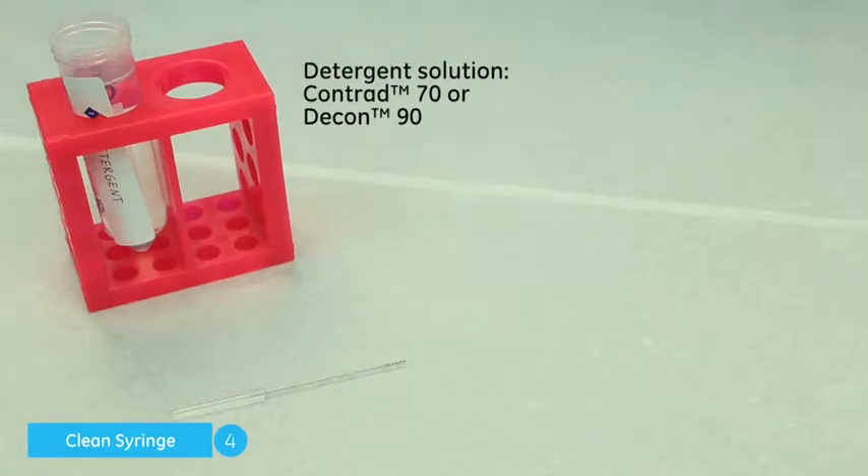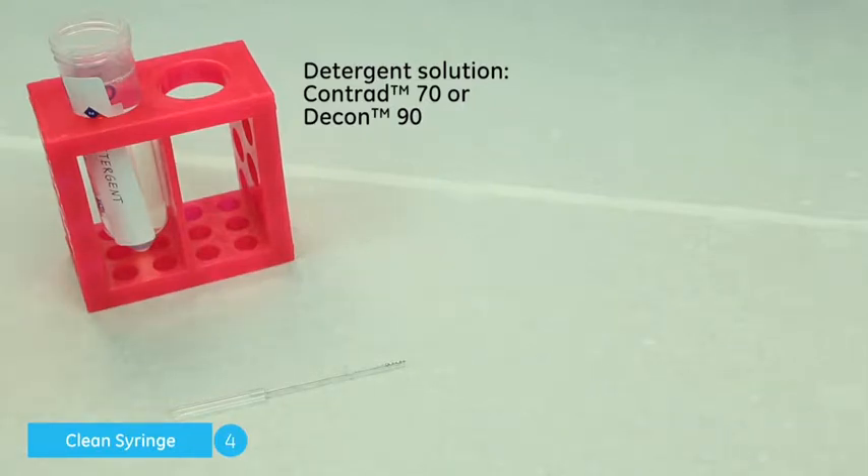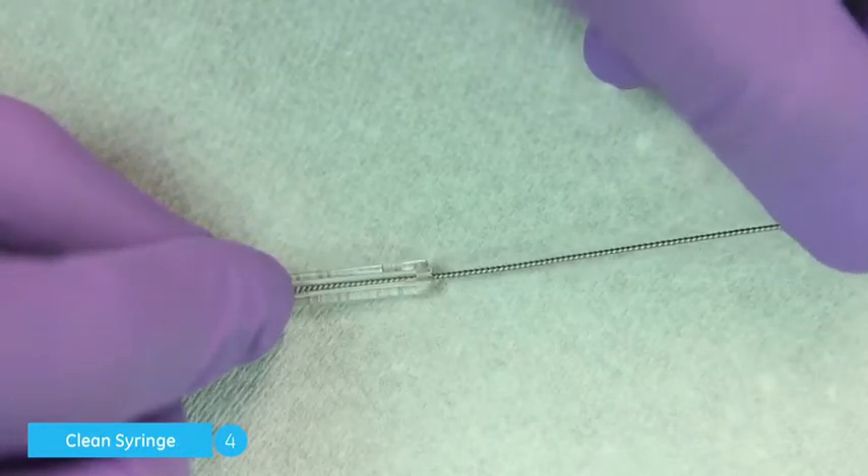To clean the inner diameter of the glass syringe, take the supplied cleaning brush and dip it in the recommended detergent solution and scrub the inner diameter of the glass syringe.